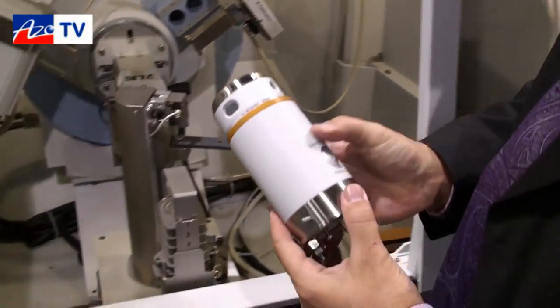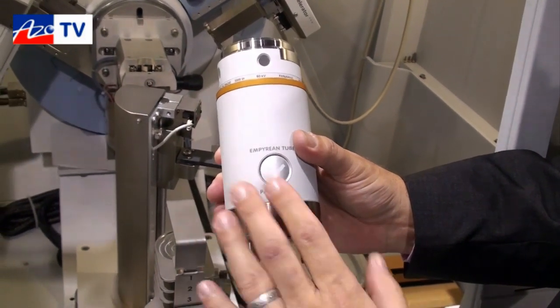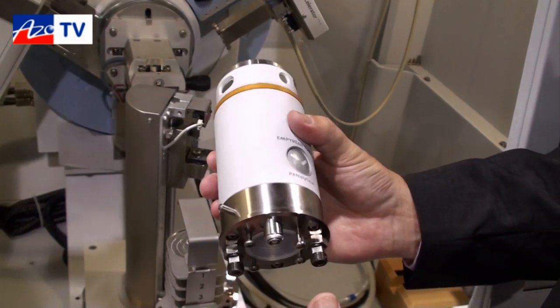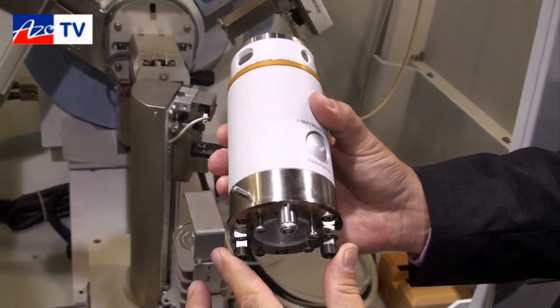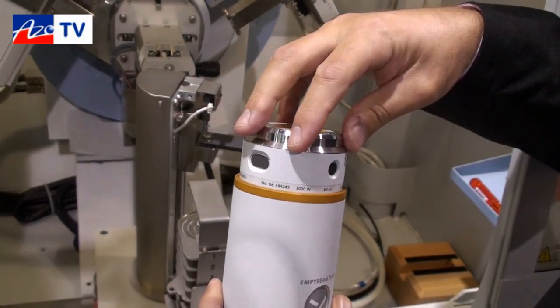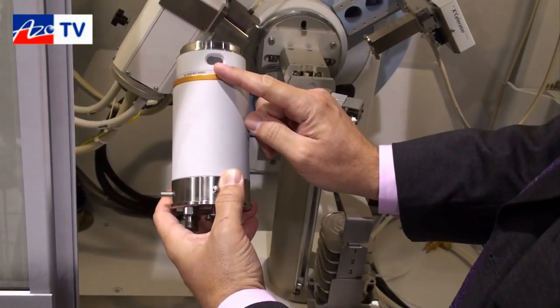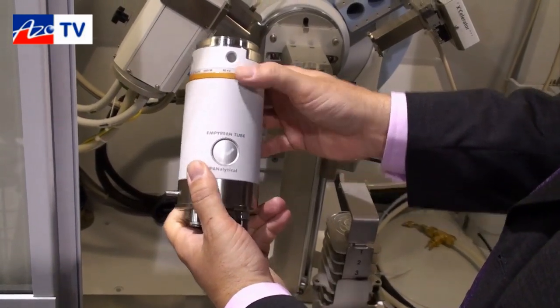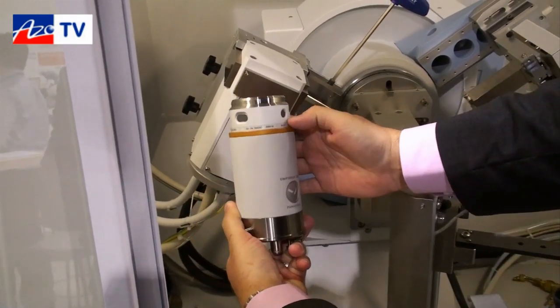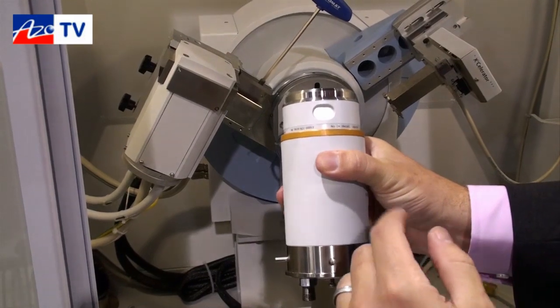Our x-ray tube technology has been developed over 60 years of experience with commercial x-ray diffraction, and even longer with x-ray tubes. This is our Empyrean x-ray tube — the latest technology in x-ray tube design. The main difference from traditional x-ray sources is that we encapsulate the water lines as well as the power inside the x-ray tube itself. With a stainless steel cap, we're able to exchange x-ray tubes from one source to another, or manipulate the tube between line focus and point focus positions for micro diffraction, texture, stress, and similar applications.